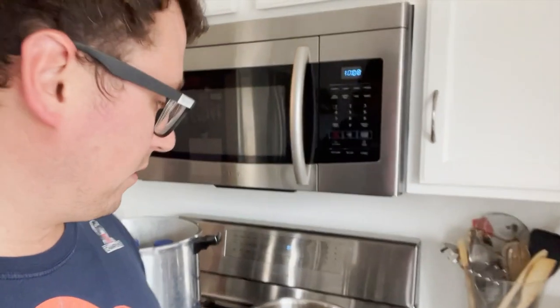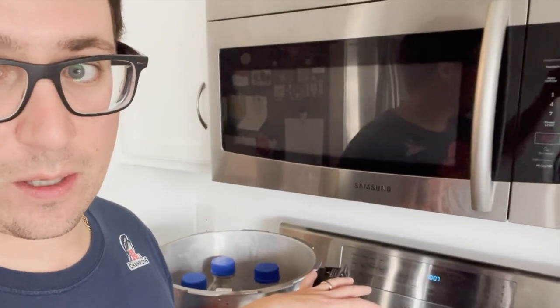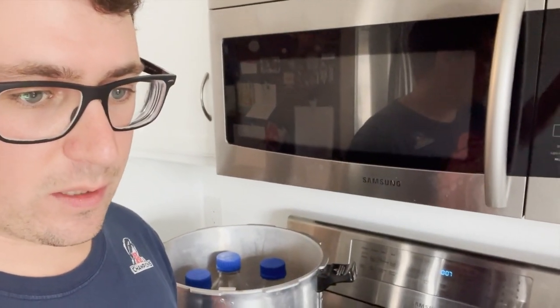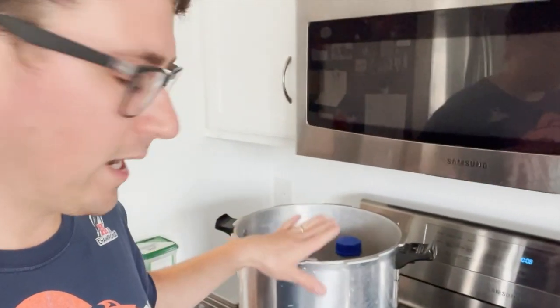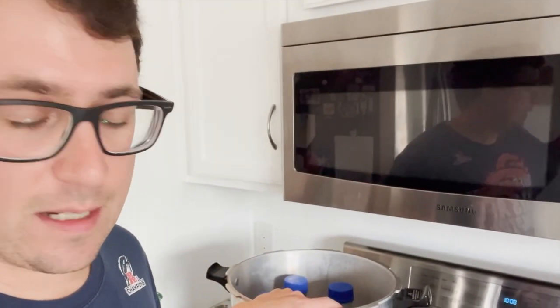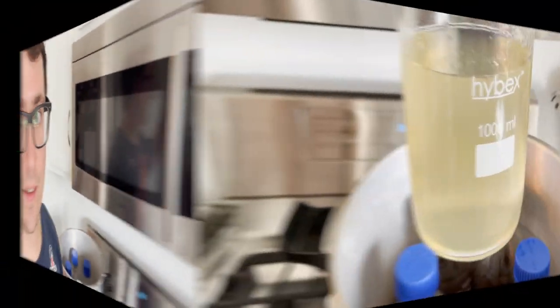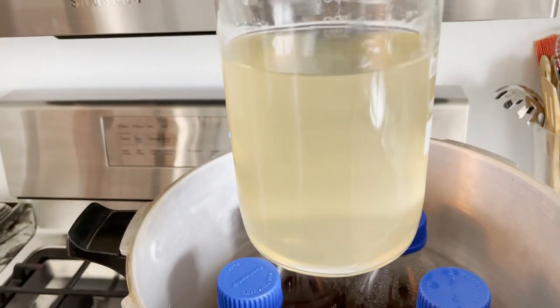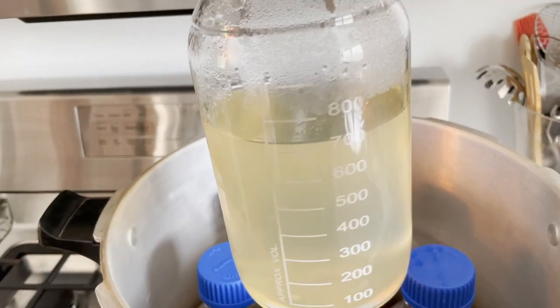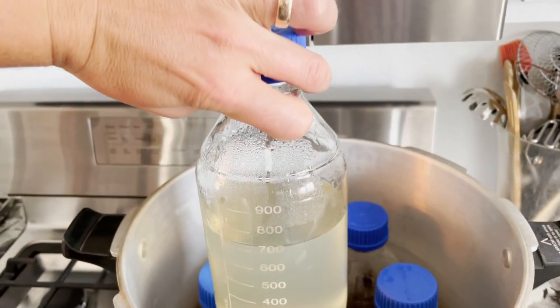So then I guess the last tip I have is to make sure that you pour them at the right temperature. We'll cook these for 20 minutes at 15 PSI or 250 degrees Fahrenheit, and then we'll let them cool down to about 130 before we pour. Right, so see how nice and clear that agar is once it's completely dissolved.